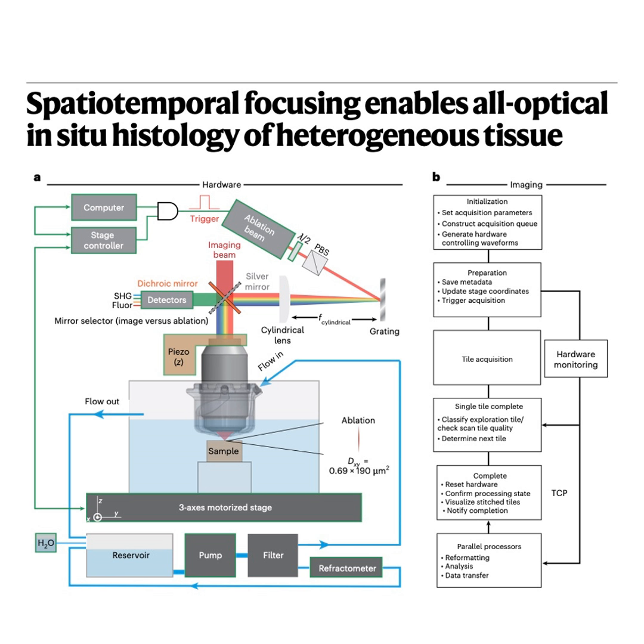Okay, faster, precise cutting, sounds great. But there's always a but in complex systems like this, right? Yes, and this one's a doozy, the bubble trouble. Bubble trouble. Remember, to get that super high resolution, the microscope's objective lens needs to be immersed in a fluid, usually something water-based. It needs that immersion medium. Right, high numerical aperture objectives need immersion. But what happens when you fire these incredibly intense femtosecond laser pulses into a water-based medium during ablation? Uh-oh. You're basically boiling the water instantly at the focus.